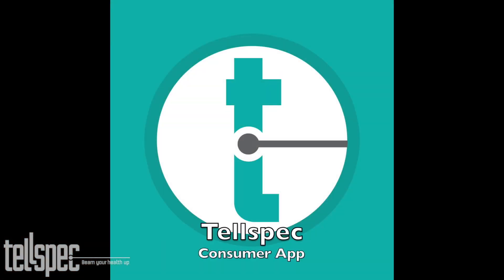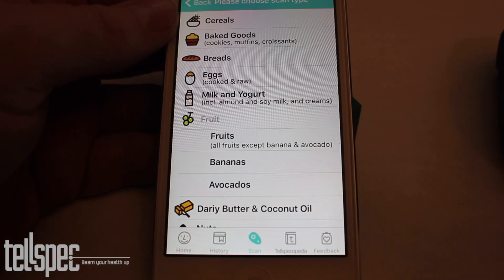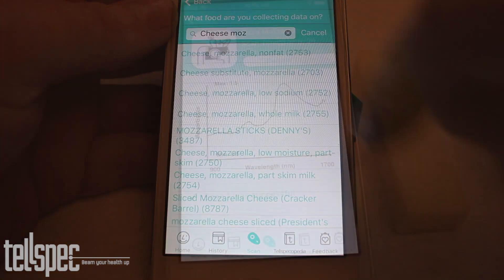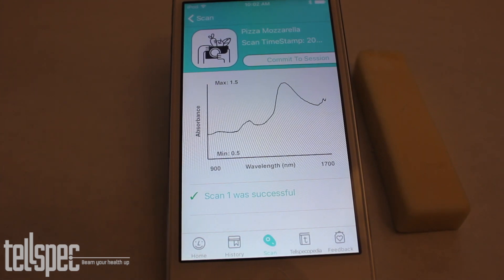Now we'd like to cover the TelSpec app. This is the consumer app and consists of two parts. The first part is for consumer use, and the second part is for commercial use and for data collection within TelSpec. This facilitates the gathering of information to be uploaded to our cloud.